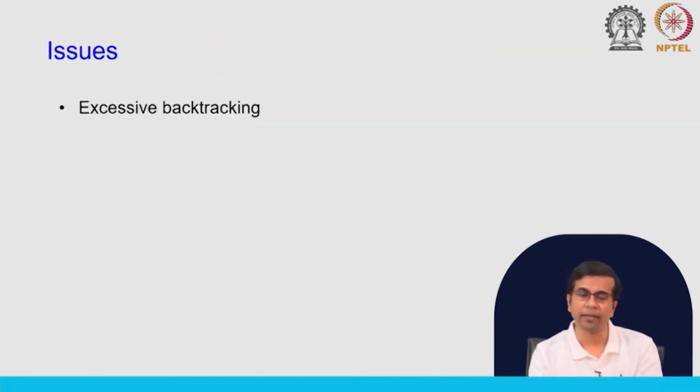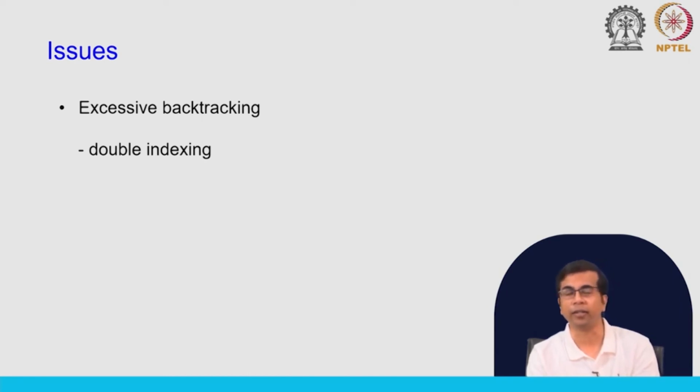To prevent that, there are ways, and it is called double indexing. So, there is this index that is created from the forward sequence. So, it is called forward index, and then you have indexing from the backwards side. So, it is not a reverse complement, it is a reverse index. So, you will see backward index also.